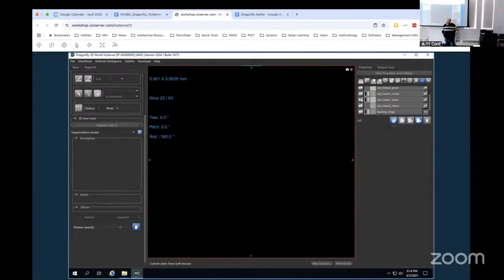We generate a tomogram that's noisy. I see. And then we change the parameters and we say, we'll make another copy. But we don't want any noise. It's not that we ask for no noise, it's just that we turn off the detector essentially. We make it kind of a perfect detector. And instead of going plus or minus 60 degrees, we go plus or minus 90, so that it's like a full tilt.